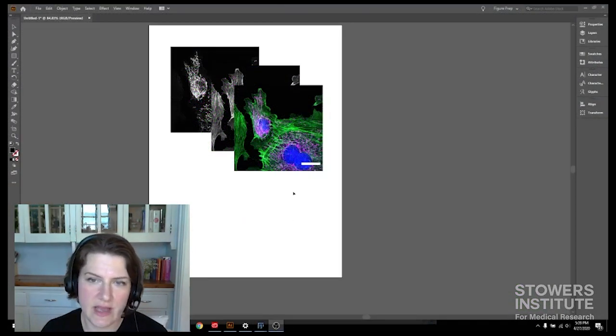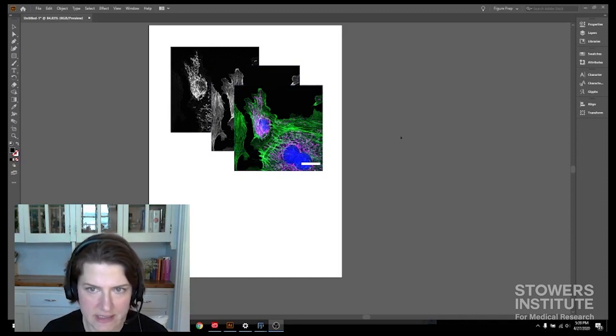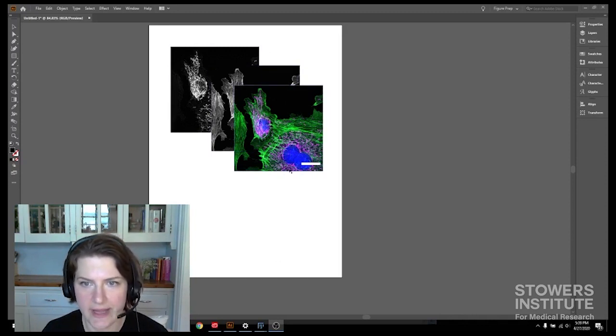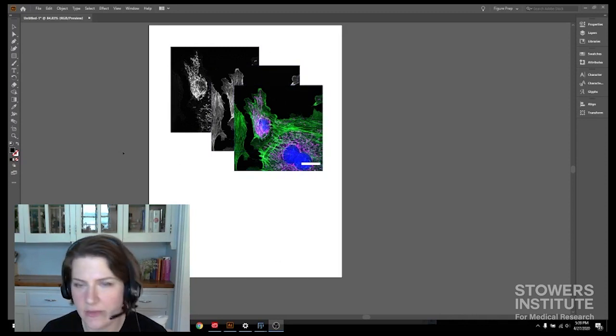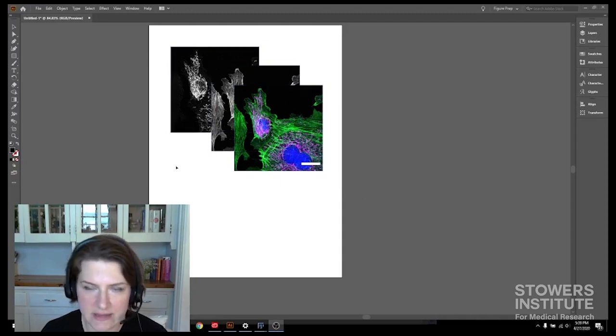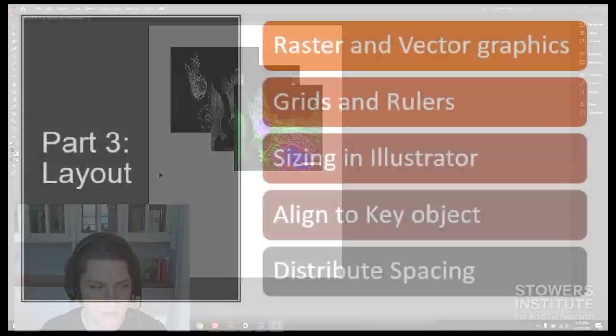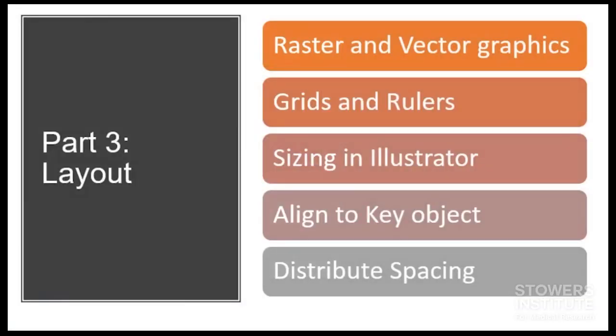So now we have some image data inside of our page and we're going to need to align it. We're going to need to put it where it belongs and we'll do that in the next section, which is part three layout. So I'll see you then.